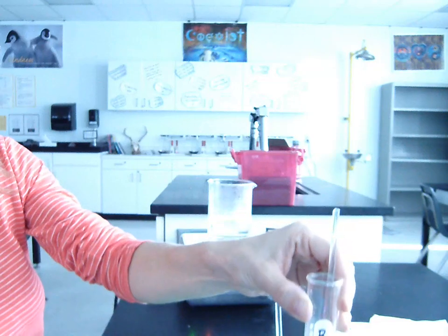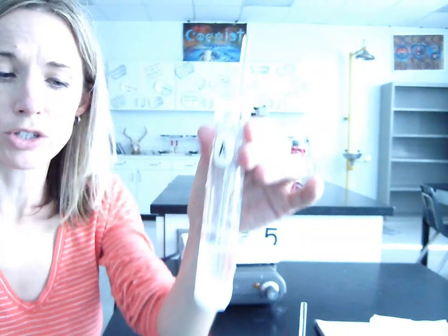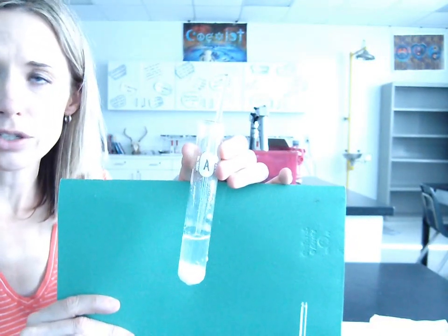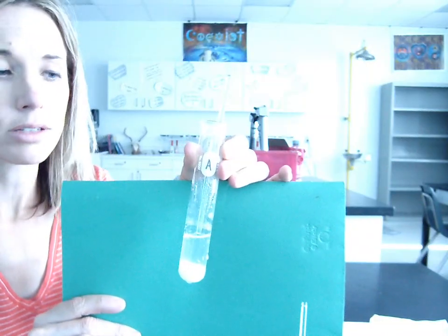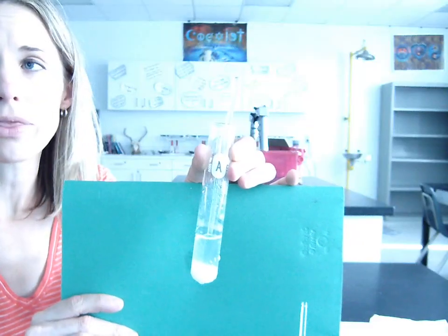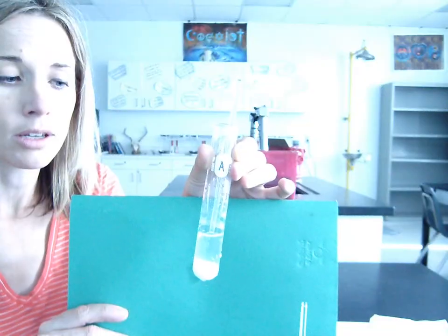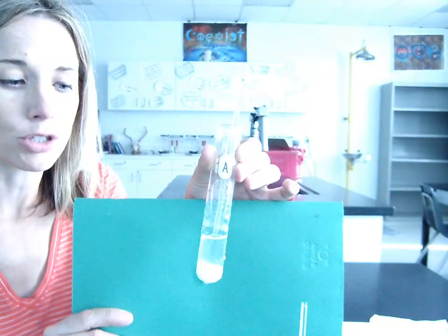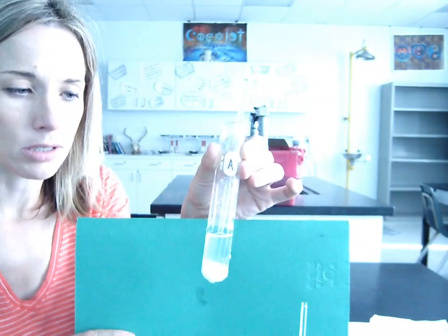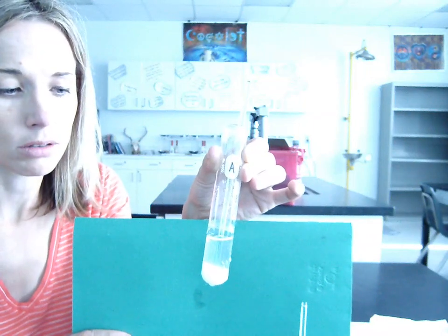So that's our lab. Substance A really does not appear to have changed much at all throughout the entire lab. At the beginning, if you go back to the beginning, not very soluble. When we heat it, still does not appear to be very soluble. Cool it down, same thing. It appears to stay about the same throughout the entire lab. So not every substance is affected by temperature with regards to its solubility. The solubility of all substances doesn't necessarily increase as you heat it, just some substances.